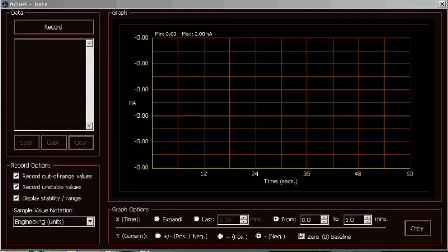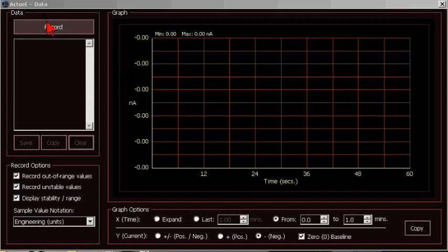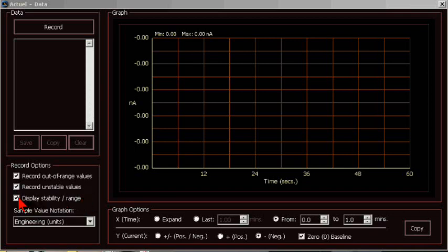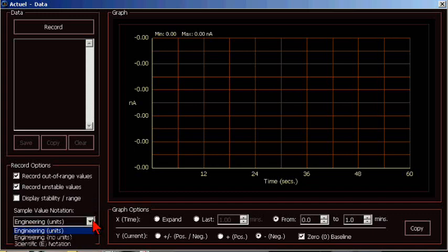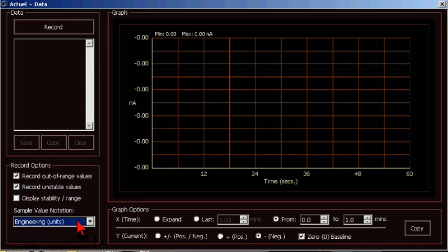The record options include out of range, unstable, and stability. By default, out of range and unstable are selected. The notation can be engineering with or without units, such as nanoamps or microamps, or scientific notation. I like engineering with units. These options are only for the raw data. The actual graph will always show nanoamps, microamps, or milliamps.